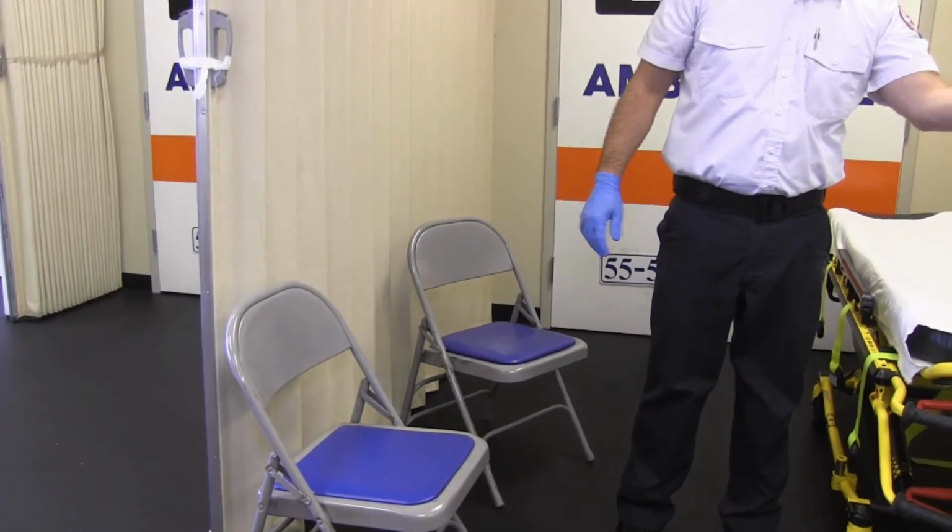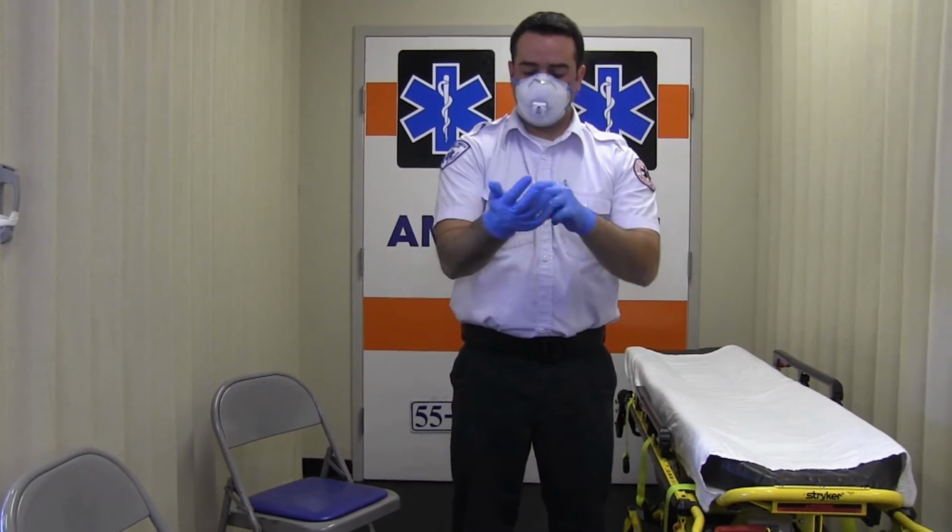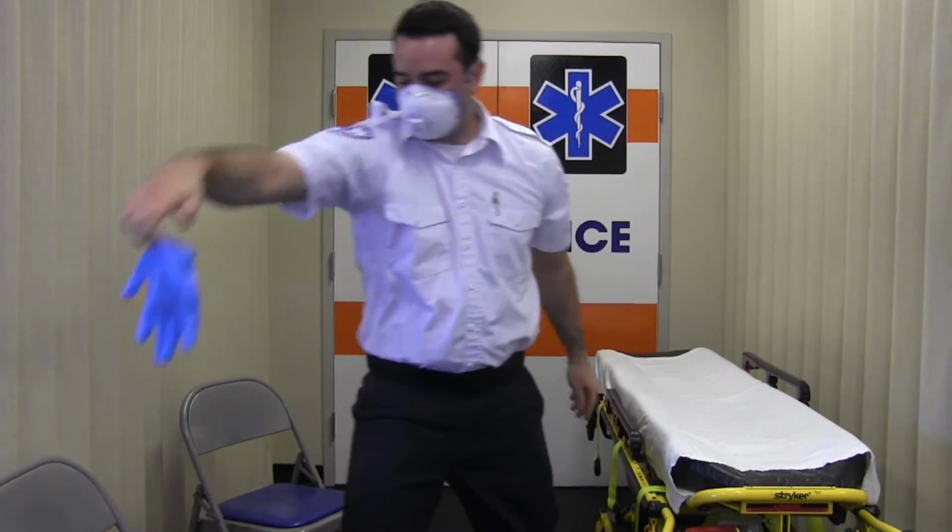Once you have removed your gown, you will then disinfect and change your inner gloves. Disinfect the inner gloves with an alcohol-based hand rub, remove and discard the gloves, taking care not to contaminate your bare hands during the removal process. Perform hand hygiene with an alcohol-based hand rub prior to donning a new pair of gloves.